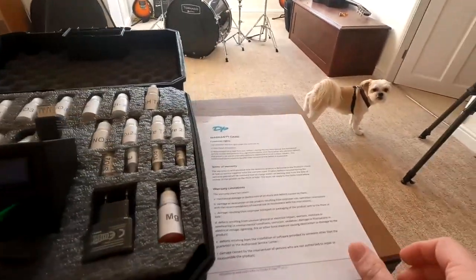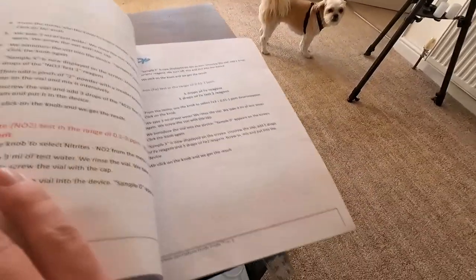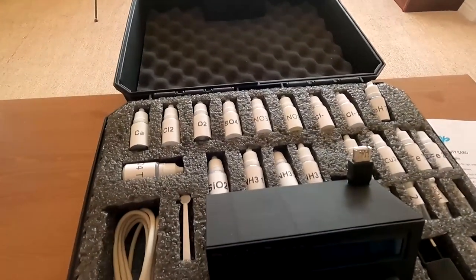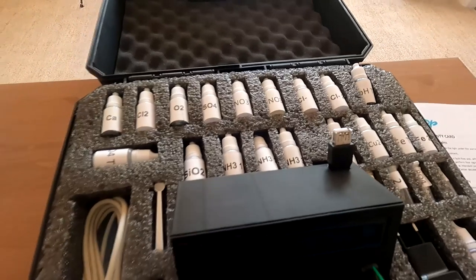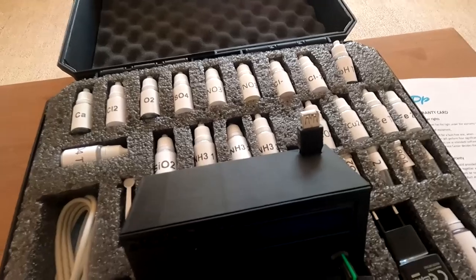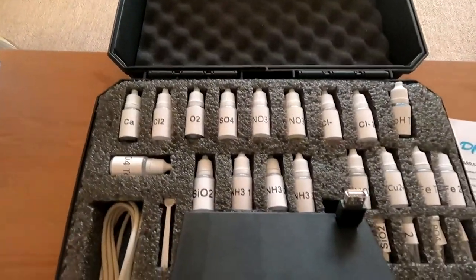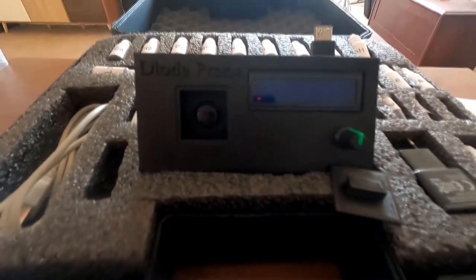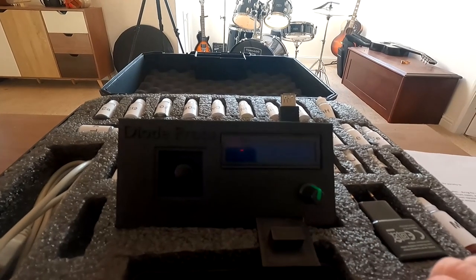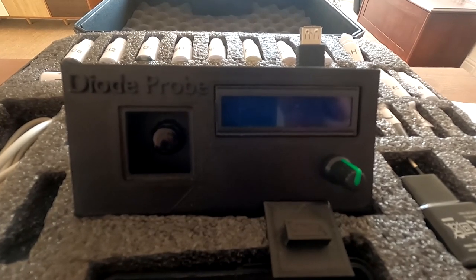There are a number of different tests, and it tells you what you need to do for each one. It does all kinds of things — nitrates, nitrite, ammonia, but also phosphates, silicates, iron, calcium, magnesium, potassium. There's loads in here — it's a really comprehensive test. The key thing for me is you put in a sample and it tells you a number. There's no comparing colour charts, no guessing.